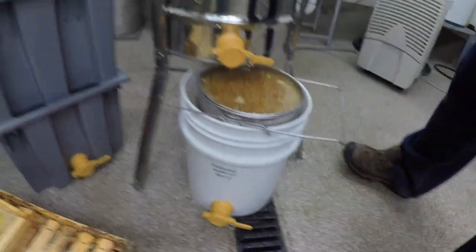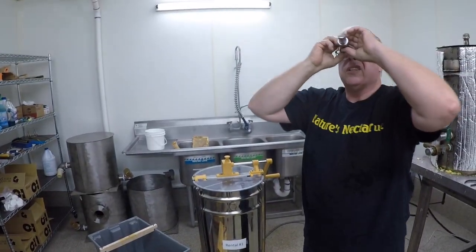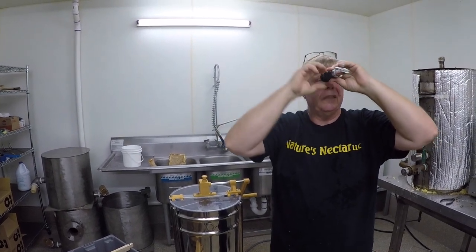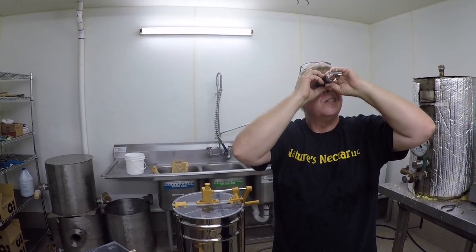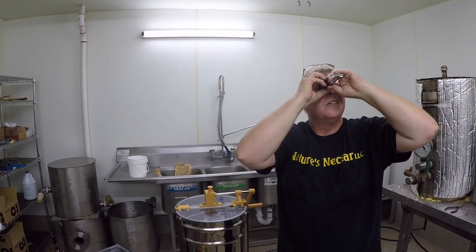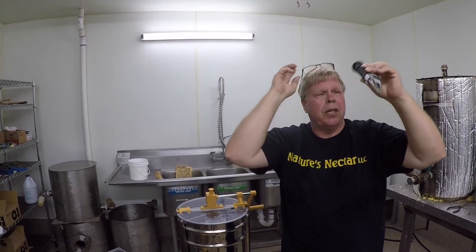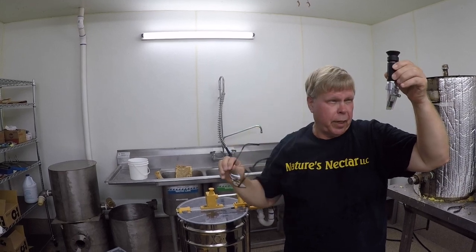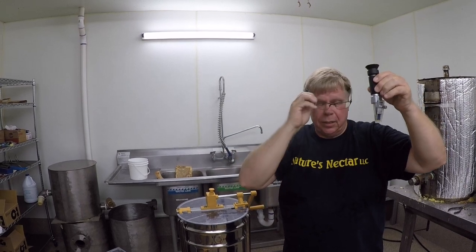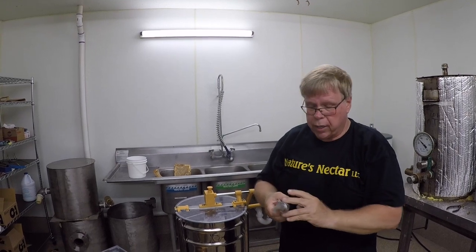Okay, then all I'm going to do is hold it to the light. Adjust it so I can see it. And this tells me that this honey has a moisture content of 17.7% water content. And then if I take my adjustment here, I take off 0.6. So this honey is 17.1% water content.